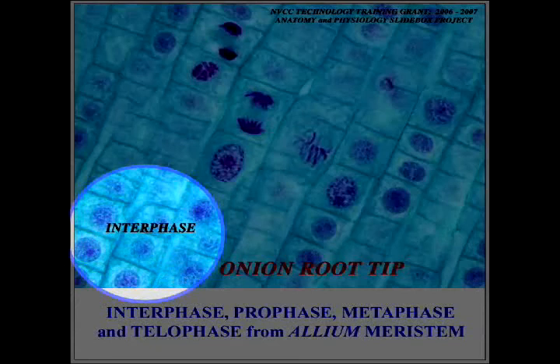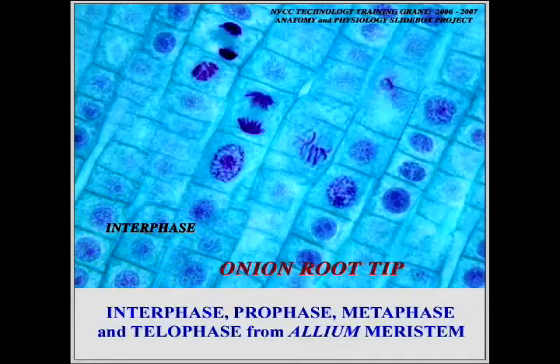Okay, so having said that, let me see if I can get out of this. And what I'll do is, there we go. Okay, the very next phase of mitosis is prophase. And in prophase, you have a condensation or a compacting of the DNA material. What happens is that chromatin material that was diffused before starts to condense, and the nuclear membrane begins to disappear. And as a result, we can look over here at a prophase arrangement. Okay, and once again, I'm going to go back and see if I can actually type in the word prophase. Let's go over here.